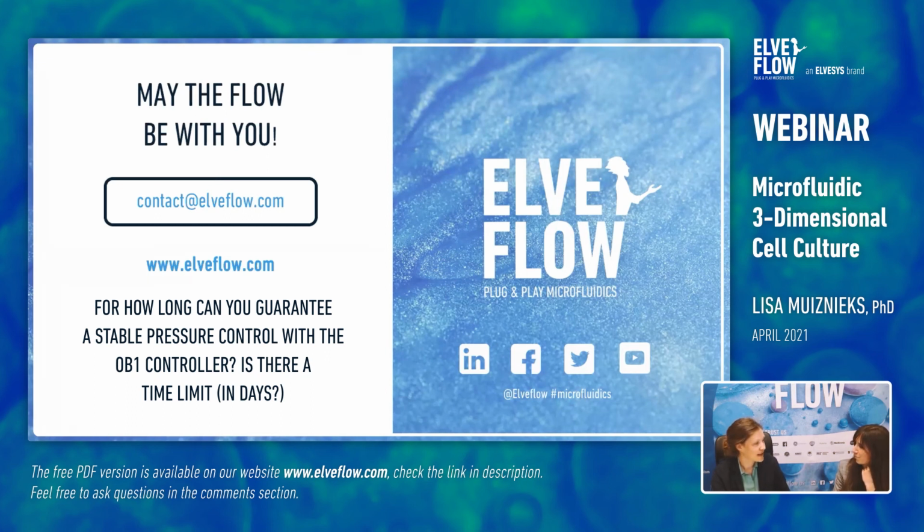Well, I agree with Barbara that the limitation is not necessarily the OB1. That's very stable for as long as your system is stable. So long as your gel doesn't break, or so long as your cells don't overgrow, for example. If we can quantify, I would say that at least days or a week, for example.